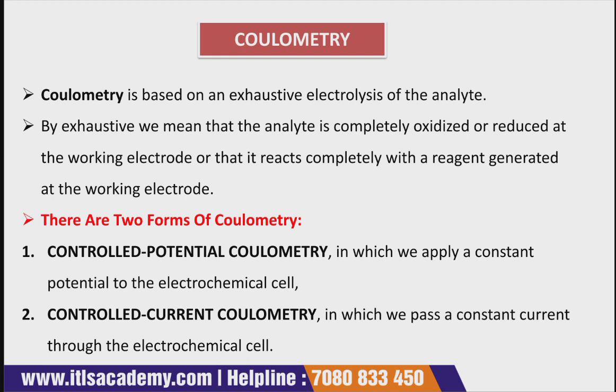As I have told you, this technique is used in electrochemistry. What is the purpose of this technique in electrochemistry? The purpose is to determine the quantity of electricity which is needed to complete an electrolytic reaction. And I have just used the word Faraday's law.